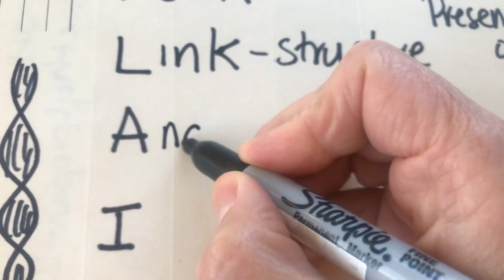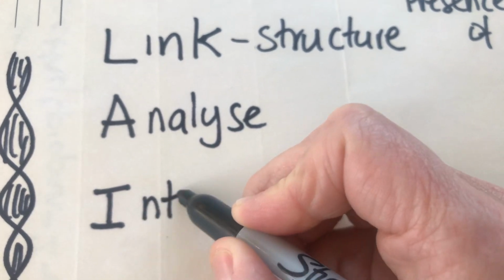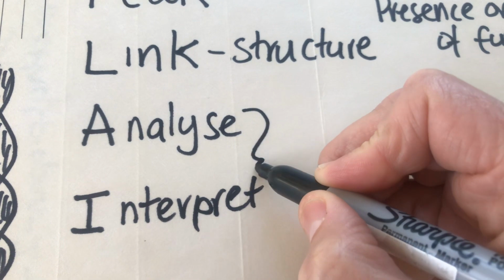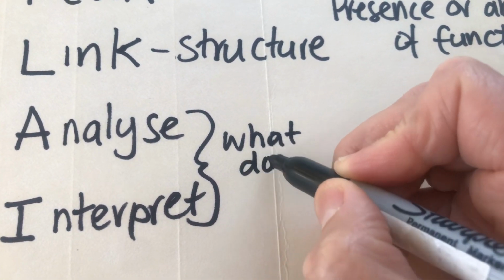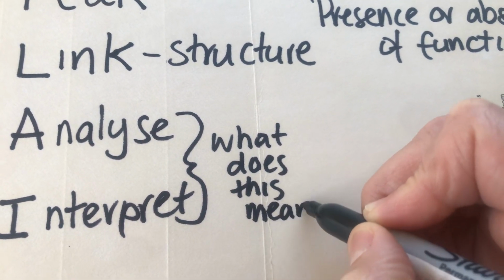So now we need to analyze and interpret. Okay, so that basically, what does this mean? What does this tell us? Now for this particular one, not much.